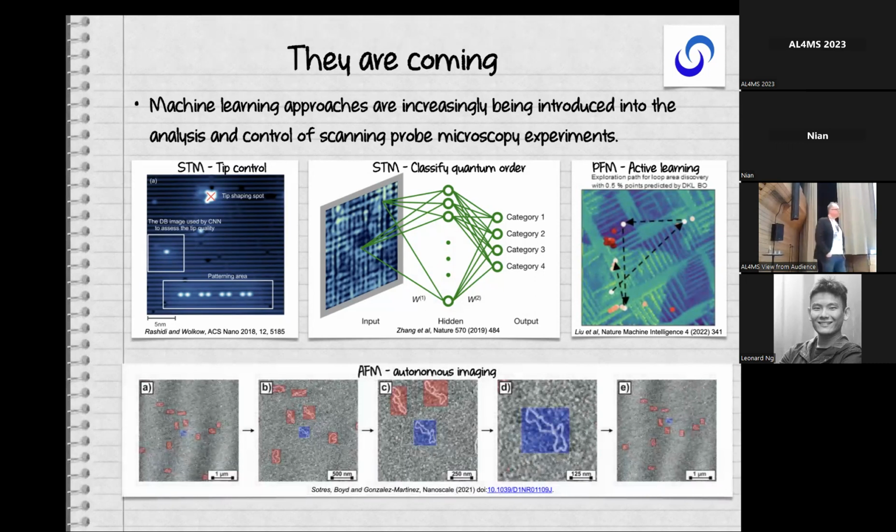And this is a similar approach now in biophysics. This is AFM imaging some, I think, DNA structures on a surface, doing a large-scale image, training a machine learning agent to recognize those features. I don't know why the blue one is particularly interesting to the biophysicist, but recognizing the structure that is of interest, the machine will autonomously, without user input, zoom in on that region and get a much higher resolution image in that area.